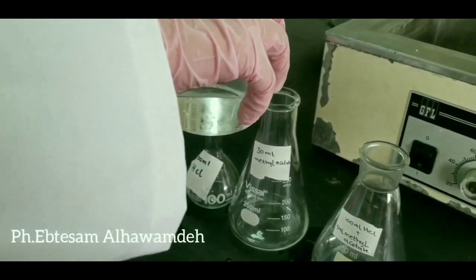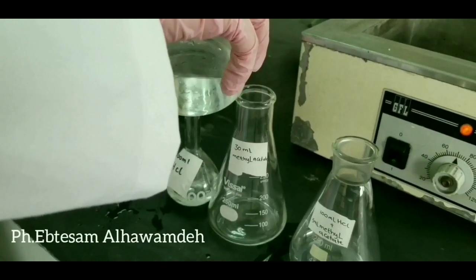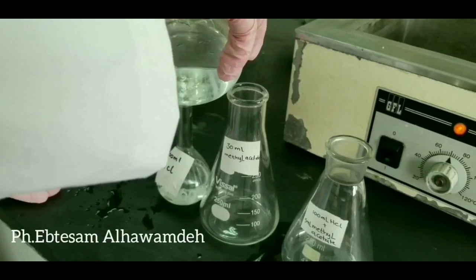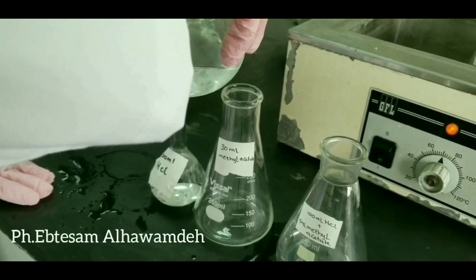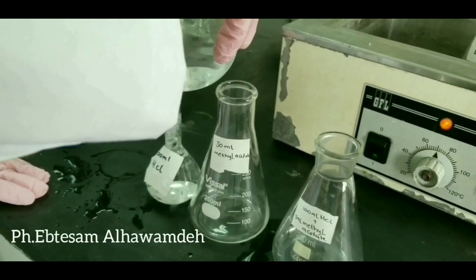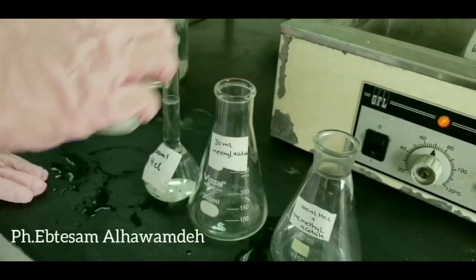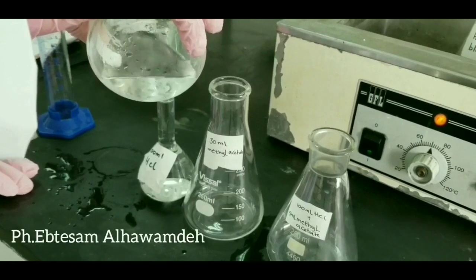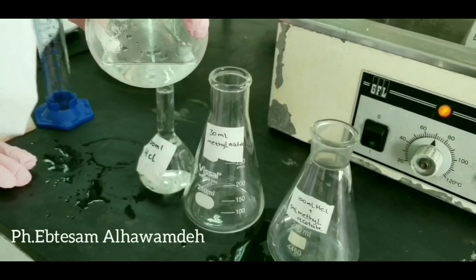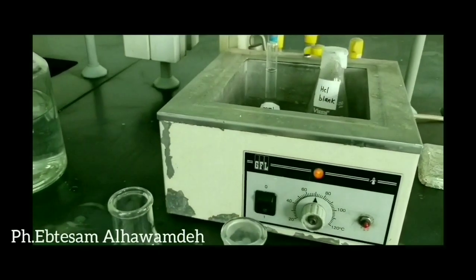In a volumetric flask, take 100 ml of 1 normal HCl and place it in the water bath at the selected temperature.